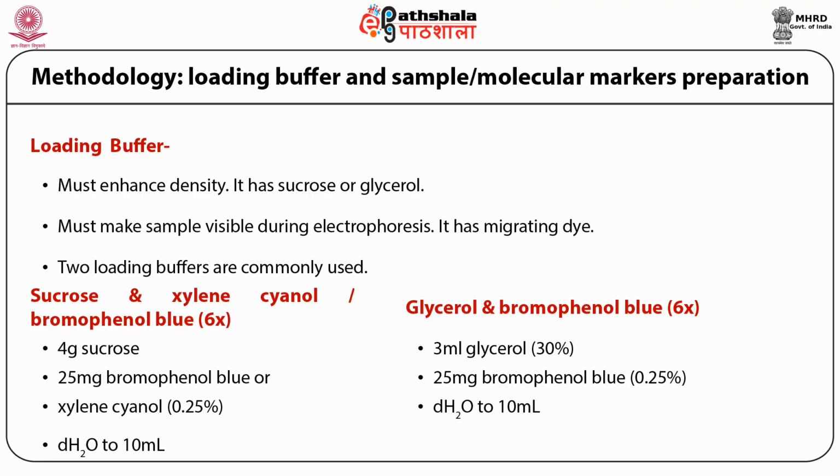Molecular weight markers, also referred to as DNA ladder, are also dissolved in loading buffer. These essentially contain a mixture of DNA molecules whose molecular sizes are known. Ladders are available in size differences of 100 base pair or smaller, or 1000 base pair.